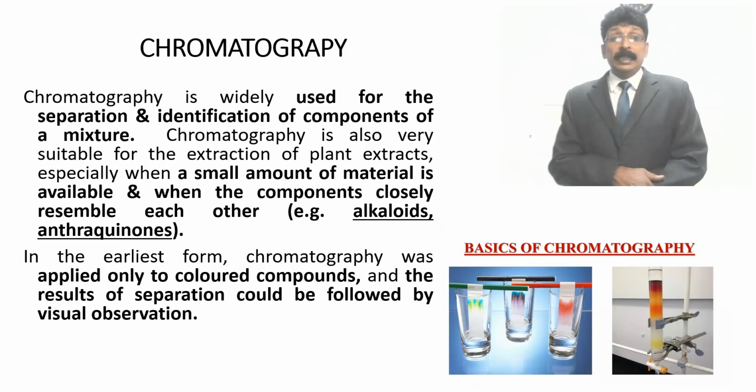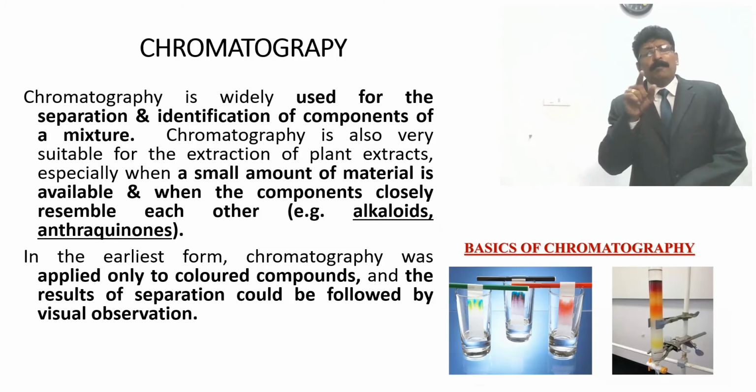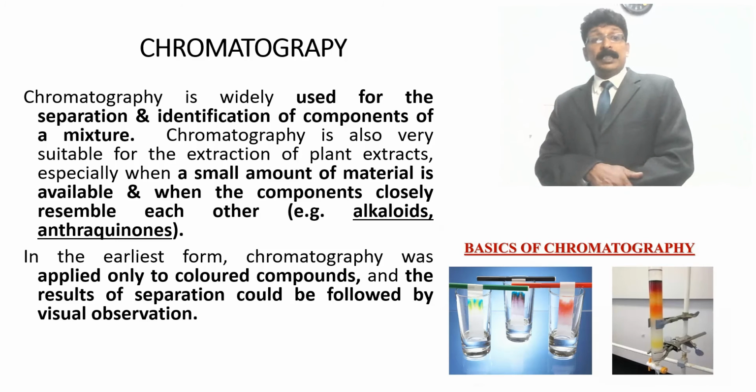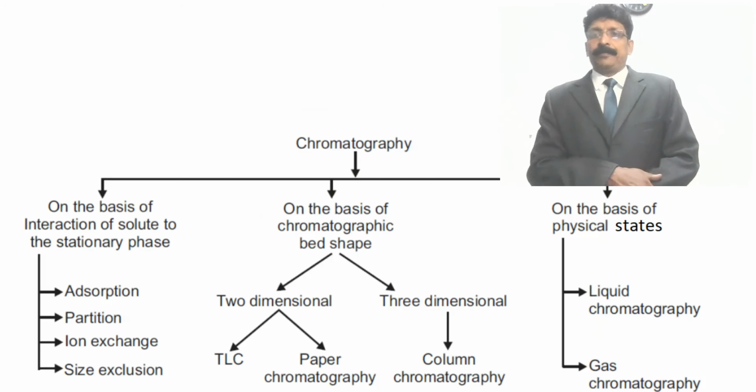In the earlier stage, chromatography was applied only for colored compounds. That is what we discussed. The results of the separation were judged by visual observation. But now there are many ways. Understand? That's what I want to say.